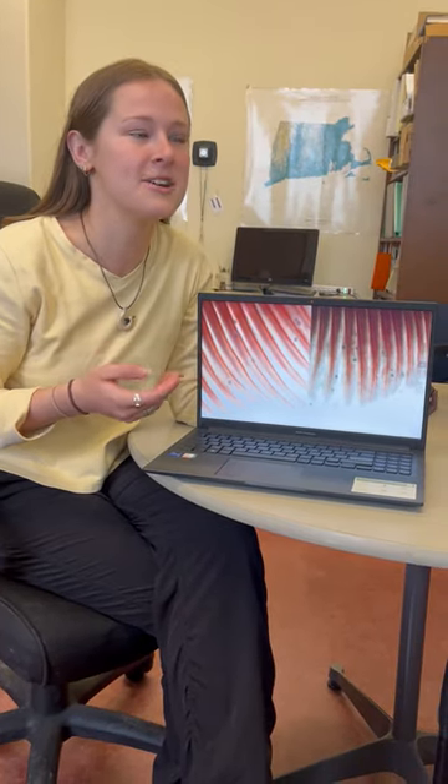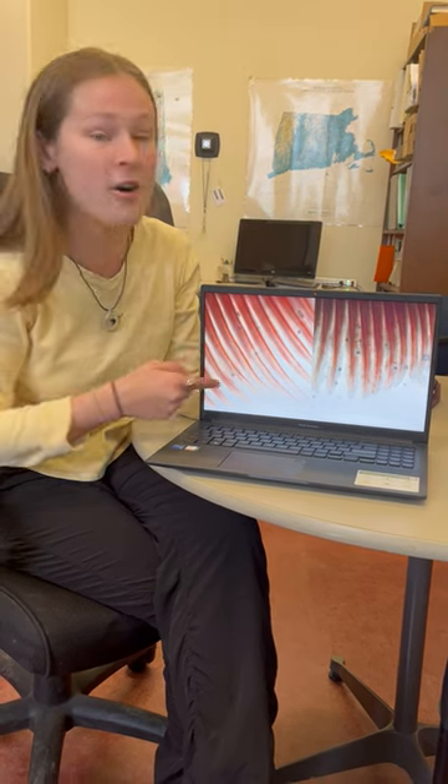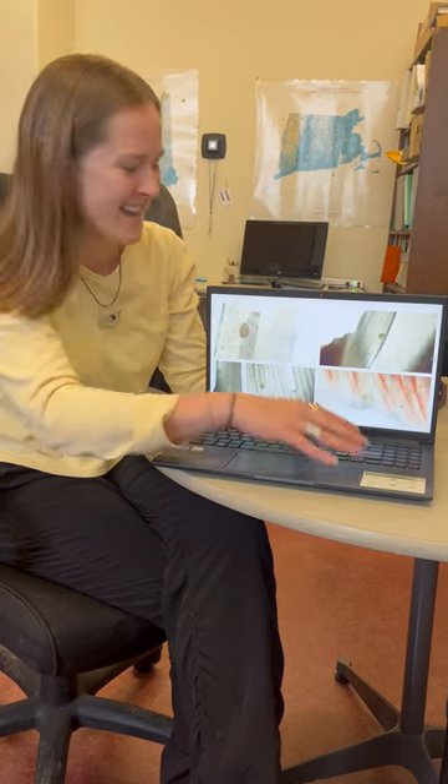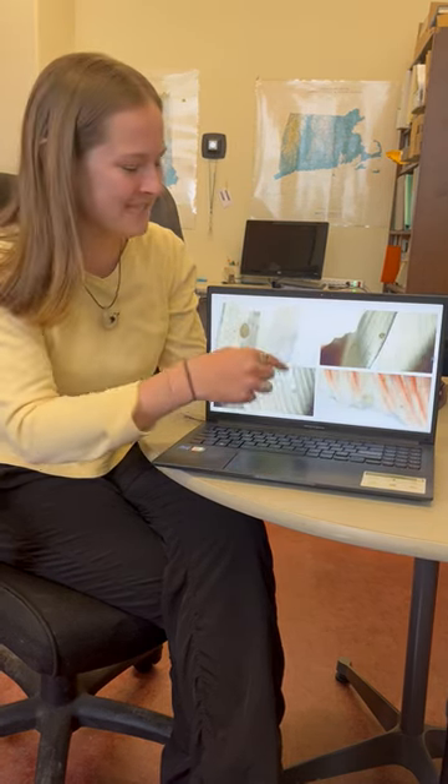As you saw in the last video, we look at our gills under the microscope and we can get counts of how many Glochidea are there. We can also take note of where they're found on the gills — whether they are on the rakers or on the filaments.